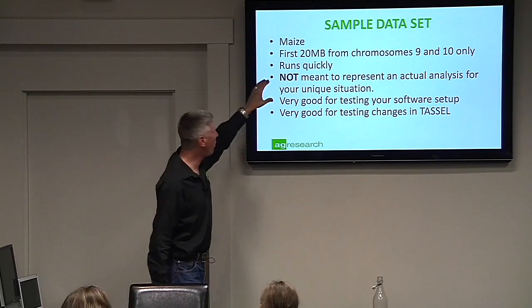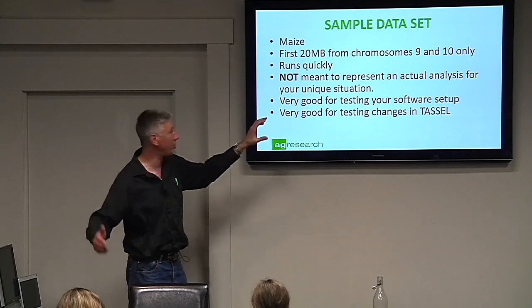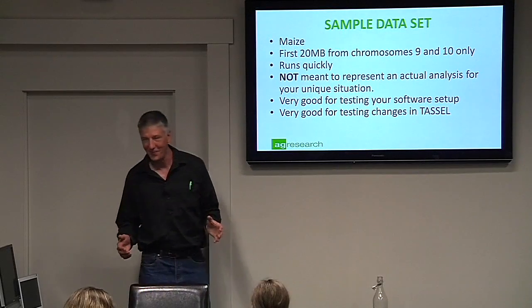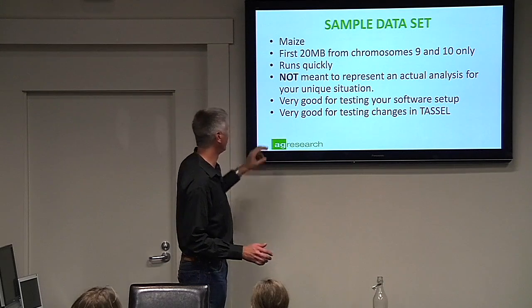Okay, the key point, and you're going to hear this from me through the rest of this workshop, is that this is not meant to represent an actual analysis for your unique situation. It's not, okay? The flags and the settings that we're using here, don't think that those are appropriate for your stuff, because they're not, okay? And that's really, really crucial.